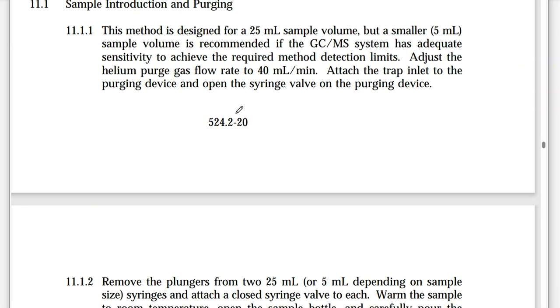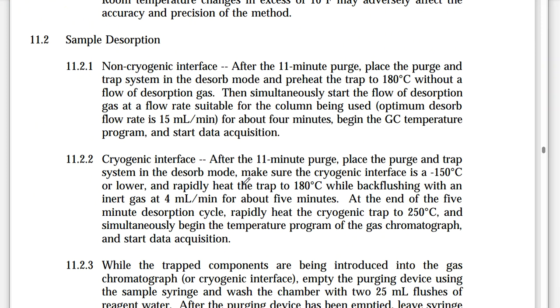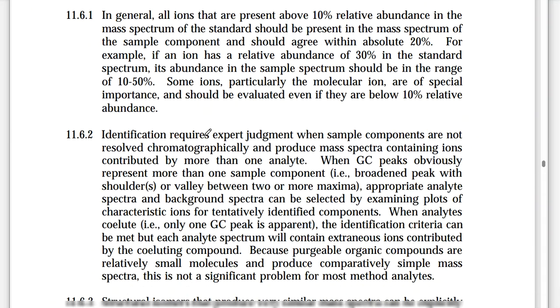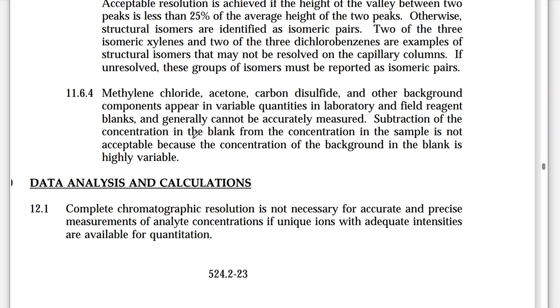So sample introduction and purging: everything from how we handle the sample, how we set the instrumentation settings, in this case, temperatures and flows and all of that kind of stuff. It's going to be detailed in here for a lab worker. Think of this as like, what temperature do I preset my oven on? Those are the types of things that we're doing here. As far as sample processing goes, how to process the sample, how to clean the sample up, what do I need to do in order for filtration, digestion, heat it up, cool it down, what goes on. So that's going to be part of the procedure section for an SOP writer.